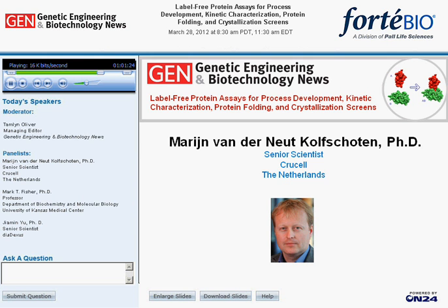Okay, another one. This one is on slide 20. How many times can immobilized tips be reused, and may tips be preserved in their running buffer, and for how long? I think this question relates to our hemagglutinin immobilization. Unfortunately, this is an example of quite an unstable antigen, and that's the reason that we were not able to reuse the tips.